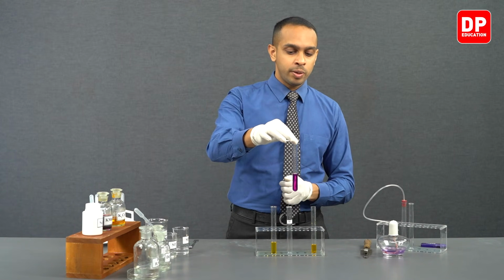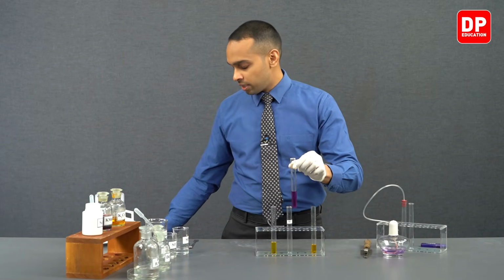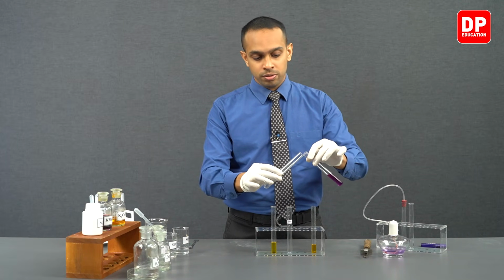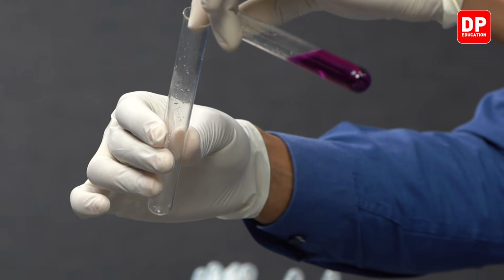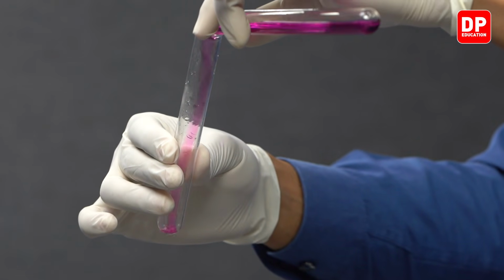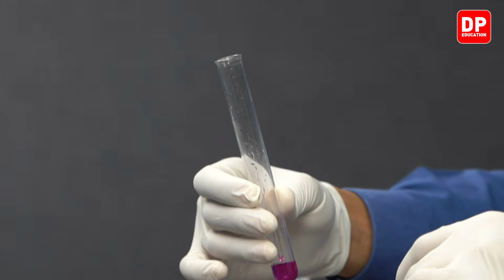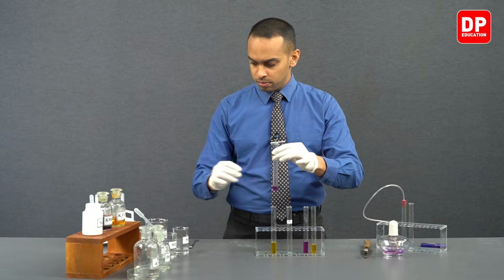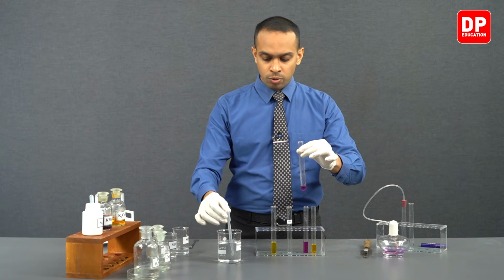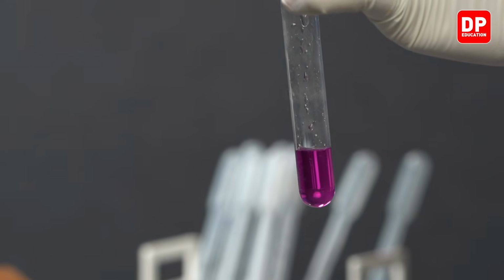We have our acidified potassium permanganate solution here. We will take another test tube and transfer a small amount of acidified potassium permanganate to that test tube. And we will add distilled water and dilute this solution a bit further.